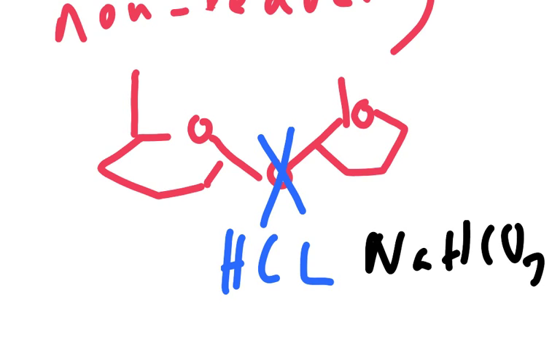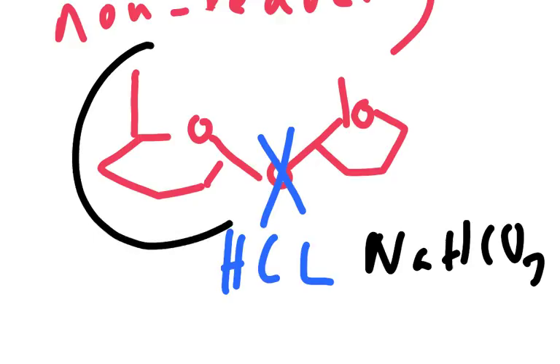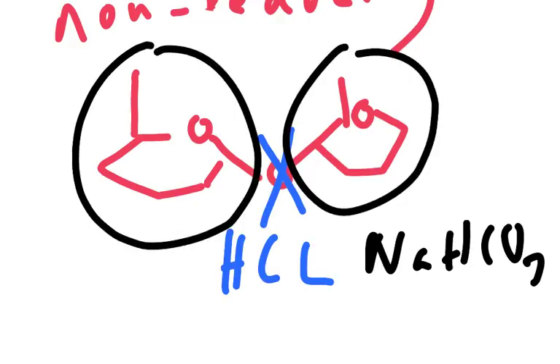And then you boil with Benedict's reagent, which means that it will now test positive because these two are now reducing sugars. So the non-reducing sugar is a sugar that tests negative with Benedict's, but you then take a fresh sample, boil it with acid, neutralise it with sodium hydrogen carbonate, then boil it with Benedict's, and then it tests positive.